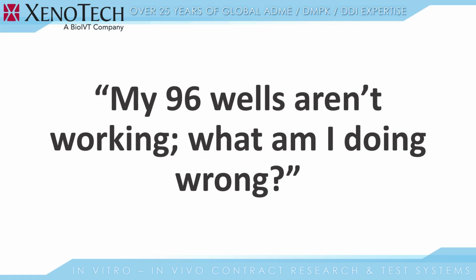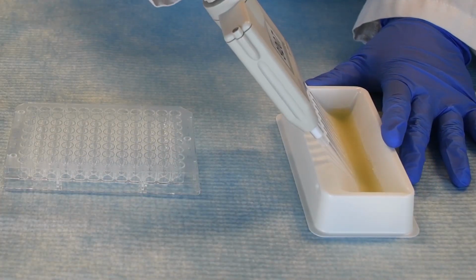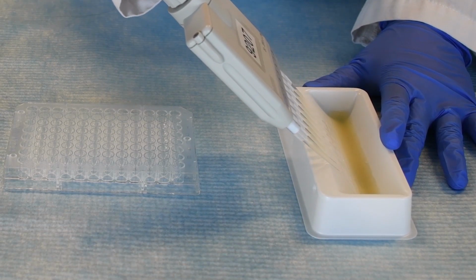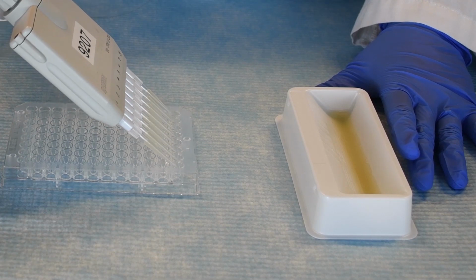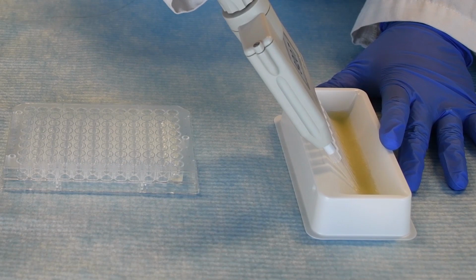96-well cultures are a very tricky format to work with. This is because well-to-well variability is a common issue. We recommend using the reverse pipetting method. This means going down all the way to the second stop before pulling up any cell suspension. When dispensing your cells, go down only to the first stop. We do this because it eliminates the possibility that air bubbles will be introduced into your wells. Air bubbles can disrupt monolayer formation, and in 96-well plates, that can make entire wells unusable.